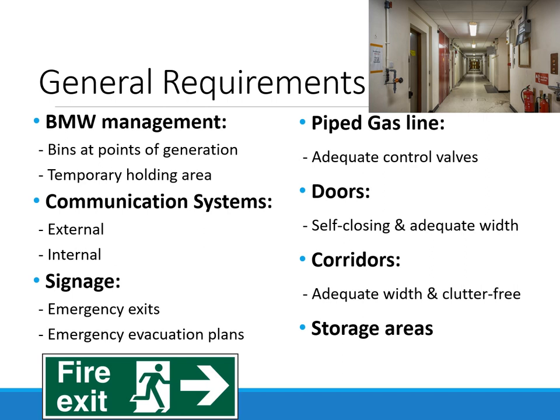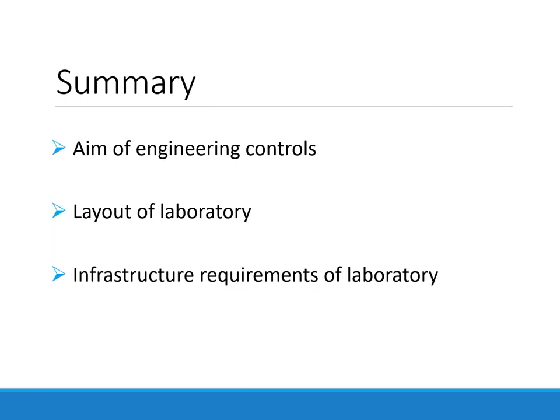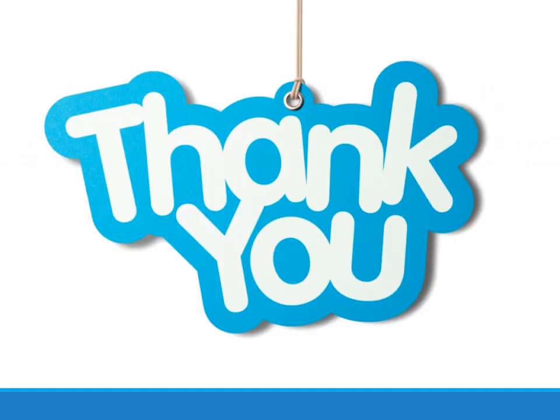To summarize: we looked at the aim of engineering controls, which is to provide a safe, accessible environment for laboratory personnel to conduct their work. We looked at the layout of a laboratory, divided into a specimen collection area, the main laboratory area, and general laboratory area, each further broken down. The infrastructure requirements included water supply, power supply, ventilation, temperature control, noise control, workbenches, communication systems, signages, doors, and corridors.